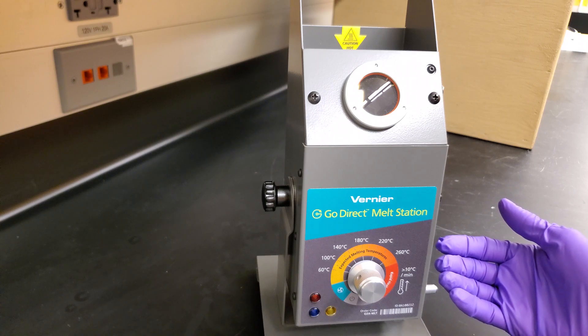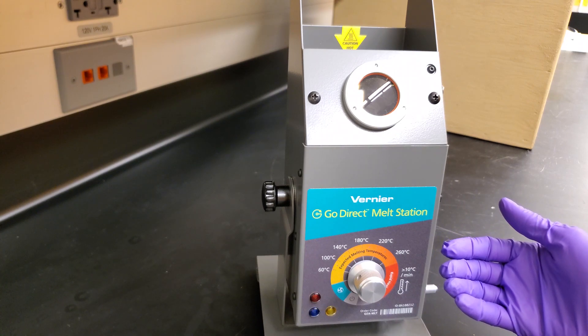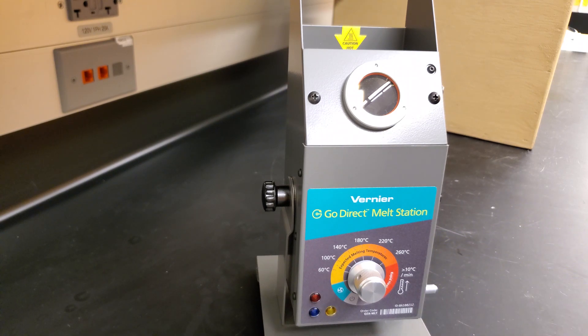It's important to have your phone located near the device when doing this. To use the app, launch the Graphical Analysis app, select Sensor Data Collection, and connect to your device. You'll then click Collect, followed by clicking Stop to manually stop data collection.